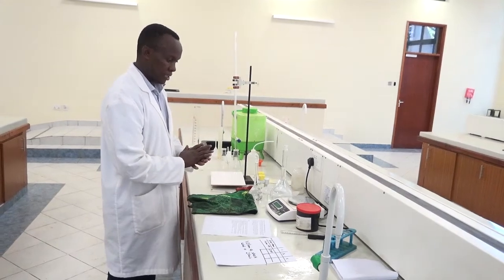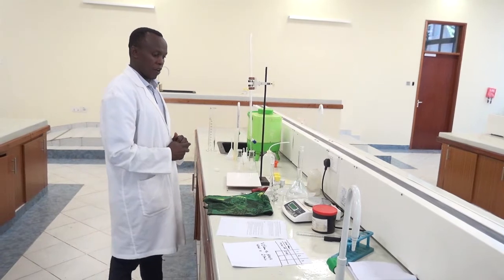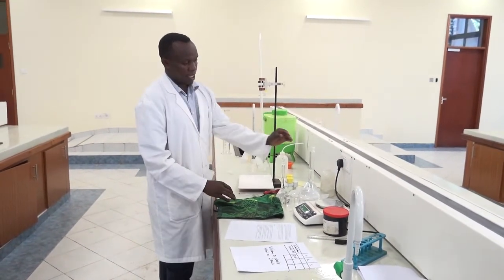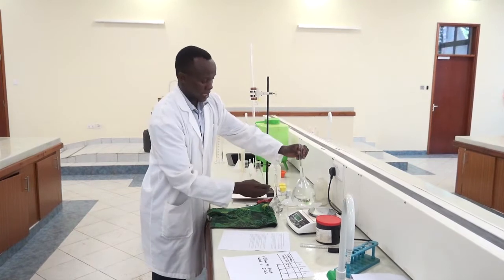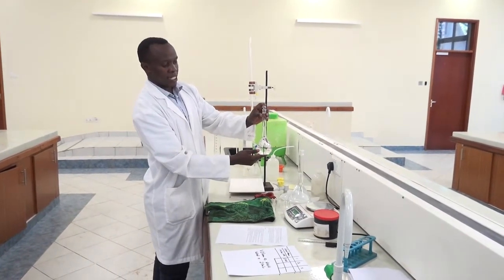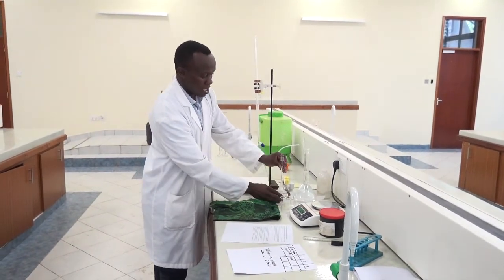I want to carry out a standardization reaction of sodium hydroxide using HCl, and this is my HCl that I have prepared. It is 0.1 molar, and the sodium hydroxide that I need to standardize is here. My aim is to get the concentration of this sodium hydroxide.